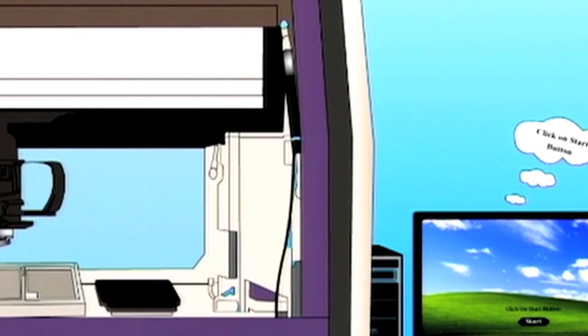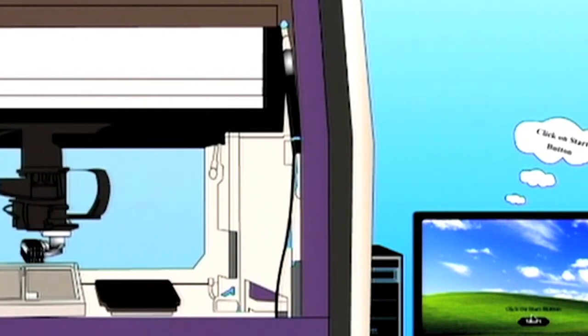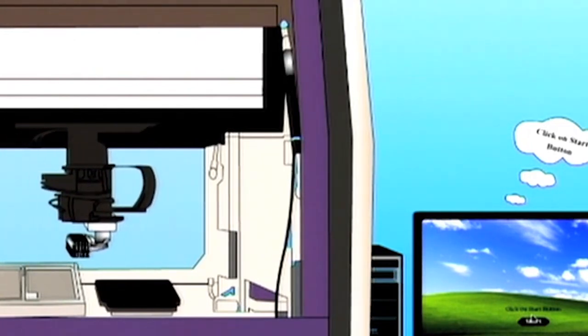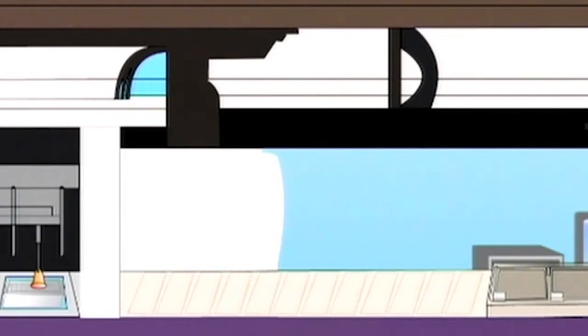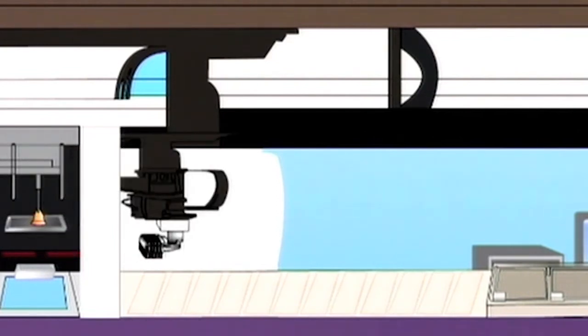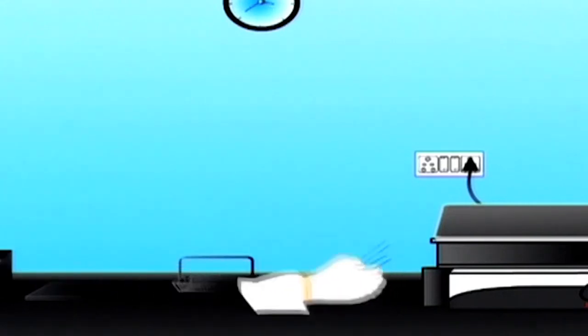So, we can use these microarrayers to print the DNA and the master mix on aminosilane coated glass slides. First, you need to ensure that pins are washed thoroughly. You can wash with ethanol and water. And during the entire printing procedure, we need to ensure that humidity is maintained at 45 to 60 percent. One can use different types of pin heads and different types of microarrayers for printing the chip. Now, this master mix can be printed on the chip.